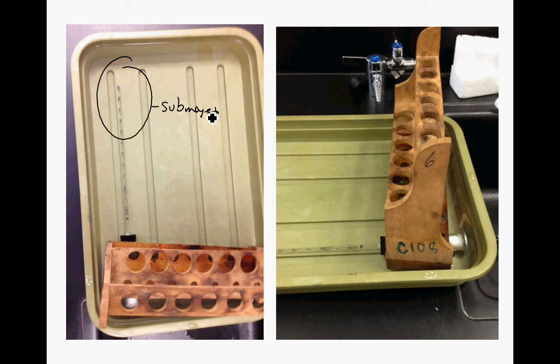Now, what's going to happen is that this pipette, when it was sitting out there, was full of gas. It was full of air. But as you submerge this, the atmospheric pressure pushing down on the water is going to push some of that water into the pipette. So you're going to have water here, and there's going to be an interface, a meniscus right here, and on this side is going to be air, and in that air is gas, primarily O2, because the atmosphere is around 20% oxygen and less than 1% CO2. So that's primarily oxygen gas in that pipette, and oxygen gas inside the respirometer chamber.